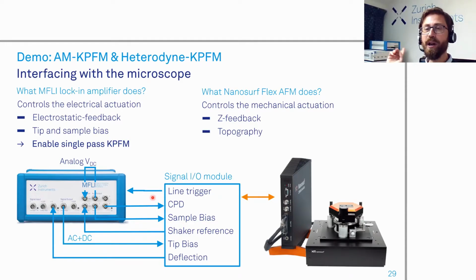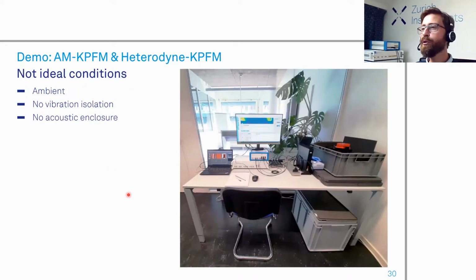As you see, I don't have a microscope here, so I control it remotely, and also we are not an SPM company. You know, Zurich Instruments is digital signal processing and FPGA, and it's actually very nice that we can have one and do some measurements, but we are far from ideal conditions. We just operate in ambient condition. There is no vibration isolation, no acoustic enclosure. And I think just from this picture you see that this is not an SPM company, but hopefully we still get some decent results.